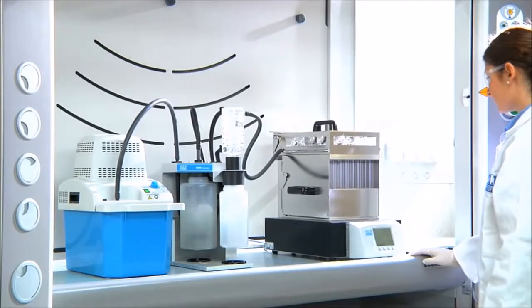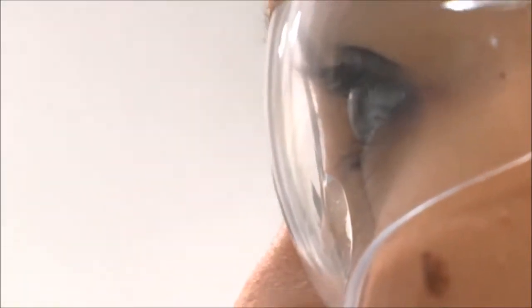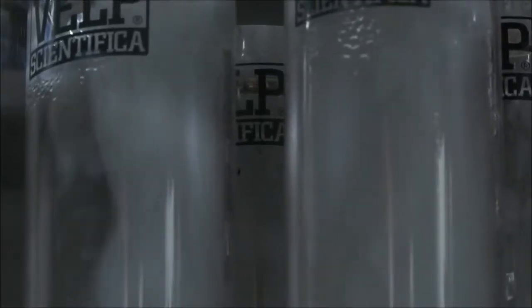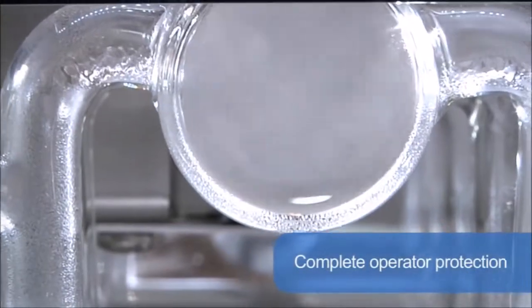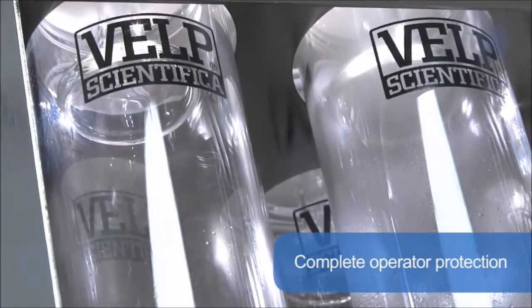Excellent visibility of the samples and any condensed vapors in the manifold give the operator the best assurance of correct operation. Complete operator protection is ensured by starting aspiration of the vapors as soon as the run starts.